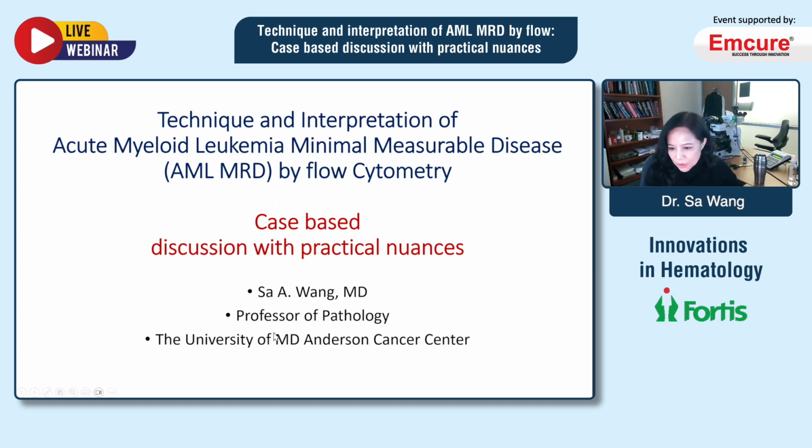As you know, I work at MD Anderson. We do a lot of AML-MRD by flow cytometry, and of course there is also molecular genetic testing on the samples. We summarized three consecutive months when we had just implemented 12-color AML-MRD: more than 379 patients achieved morphologic remission in that period. I think this data is quite interesting for people interested in implementing flow cytometry in their laboratory.